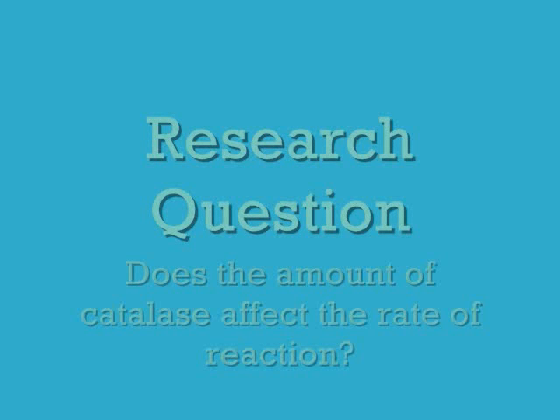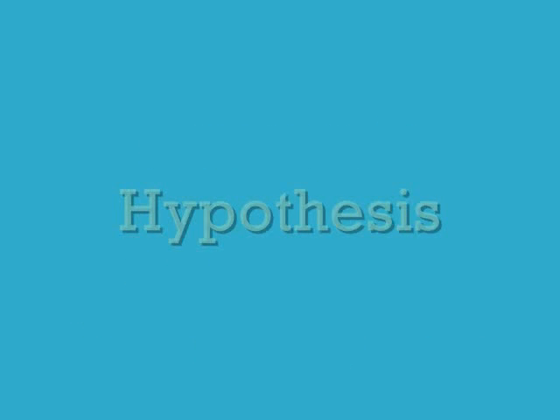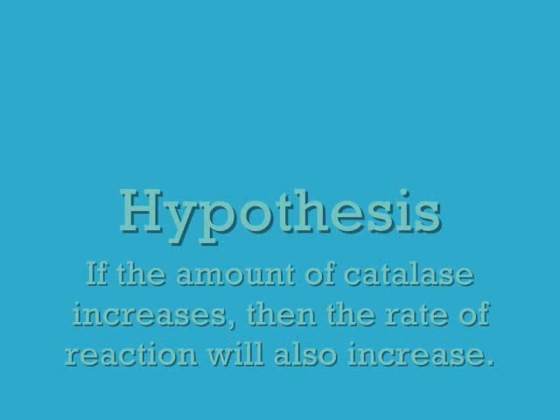In this experiment, the question that we're going to try to answer is, does the amount of catalase affect the rate of reaction? Our hypothesis for this experiment is, if the amount of catalase increases, then the rate of reaction will also increase.